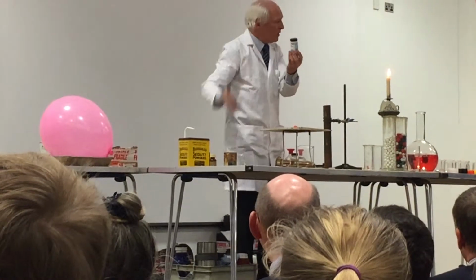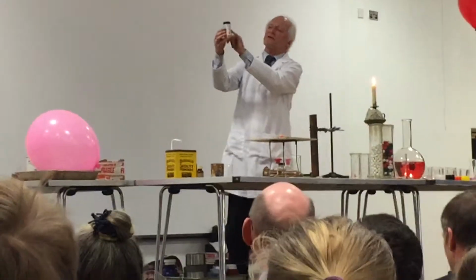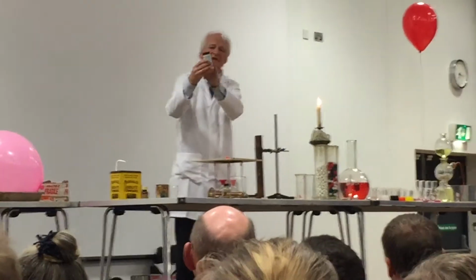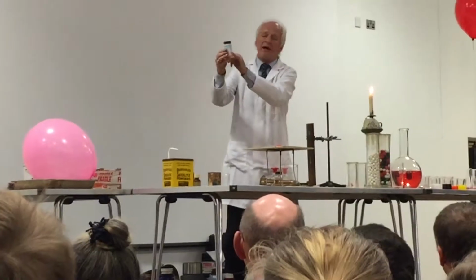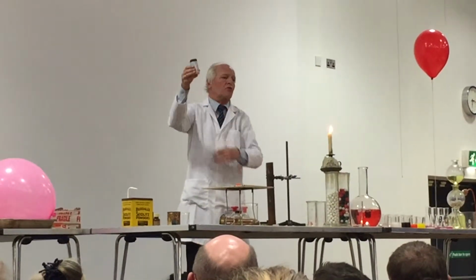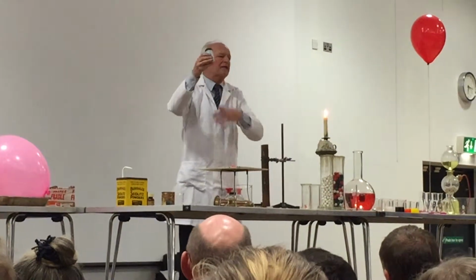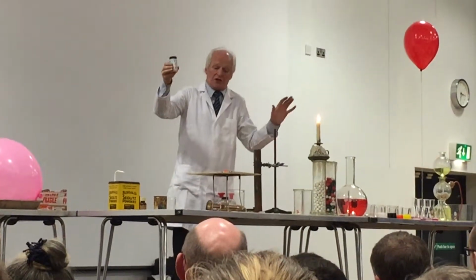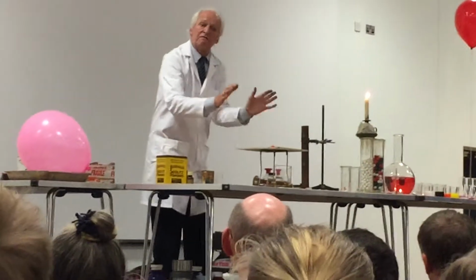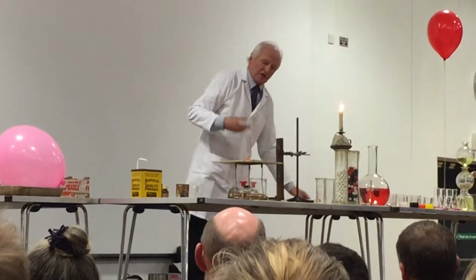of chemistry, or indeed in the world in general, is to read the hazard symbols. The hazard symbols on this, you see there's a flame, which tells you it's an oxidizing agent. Skull and crossbones tells you it's a deadly poison if you take it in. There is a picture of a hand being burnt with a liquid. This tells us that it's strongly corrosive if you dissolve it in water on your hand. And finally, a picture of a man seeming to have a heart attack. Basically, it's a carcinogen. In a nutshell, this substance, ammonium dichromate, is very toxic. However, if we handle it in the proper way, then it is perfectly safe.